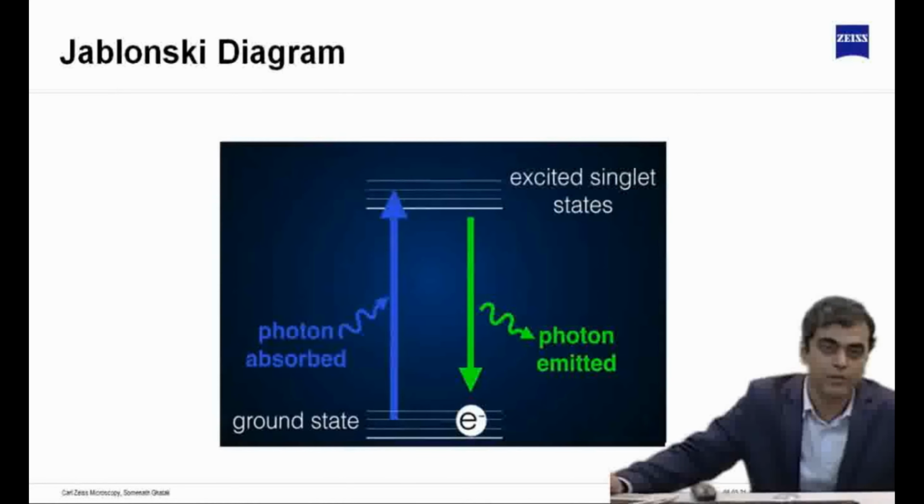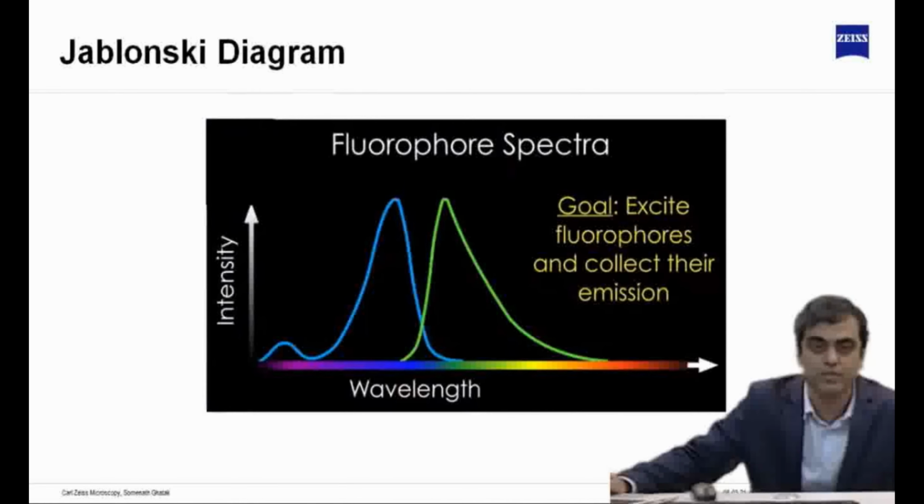But after going to the excited state, there are a lot of molecular vibrations in that state. So there is a certain loss of light or loss of energy during the molecular vibrations. But again, it falls back to the ground state and ends up giving photons, which is the signal emitted. And this signal is what is tapped for fluorescence studies.